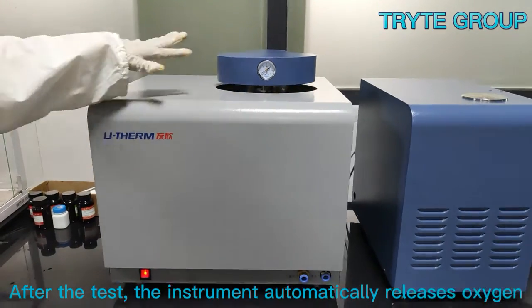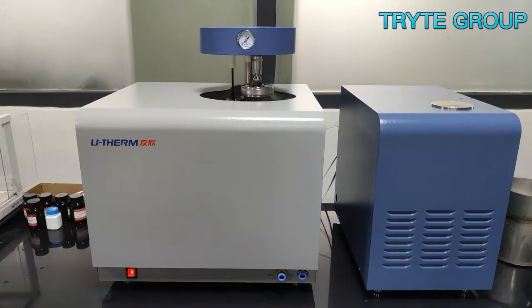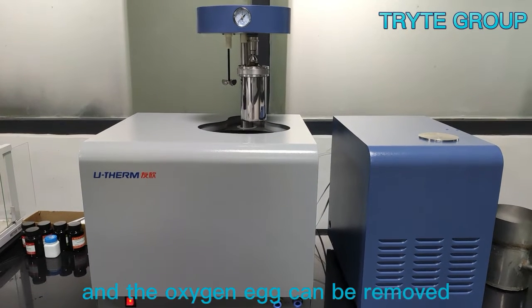After the test, the instrument automatically releases oxygen, the lifting device automatically rises, and the oxygen bomb can be removed to complete the experiment.